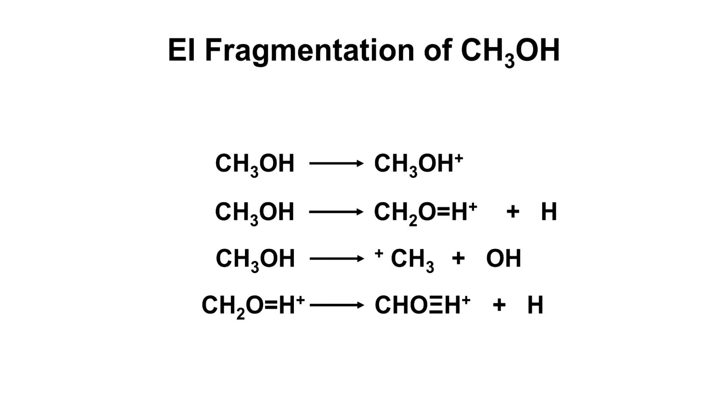So if you're using electron impact or electron ionization, if you start with something like methanol, it will produce these types of fragments. First, an ionized form, which flies through the quadrupoles, but also fragments in kind of weird ways, where you'll form double bonds or triple bonds, or hydroxyl groups are flying off. And these are detectable, and they produce very characteristic peaks that tell you that the molecule is there.